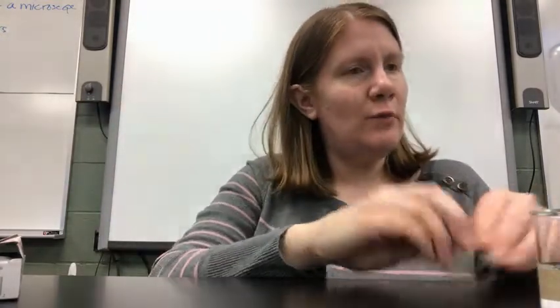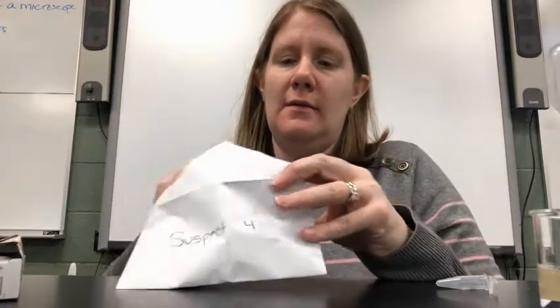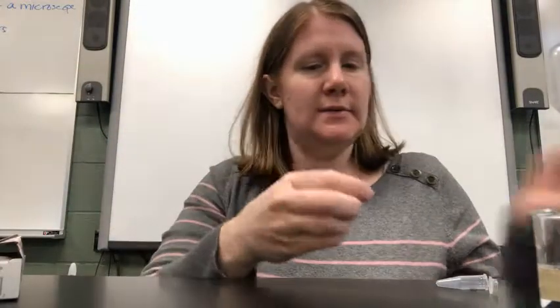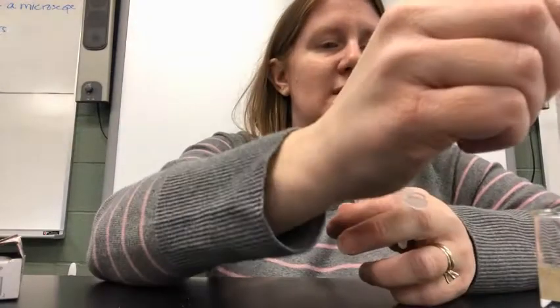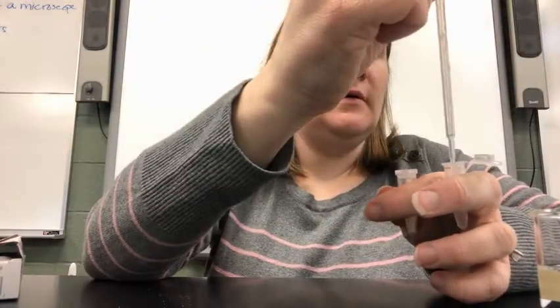Okay, and then we just have one more tube left, suspect 4. So take the empty tube, the sample tube, put our rubbing alcohol into the empty tube, open the sample, new toothpick. We want to get a new toothpick every time because we don't want to contaminate any of the samples.